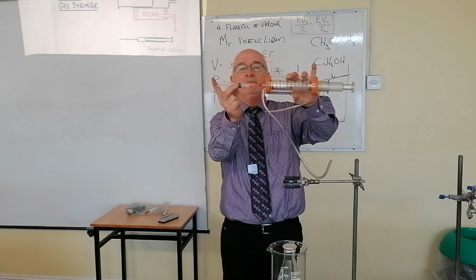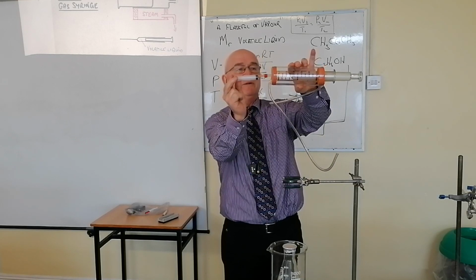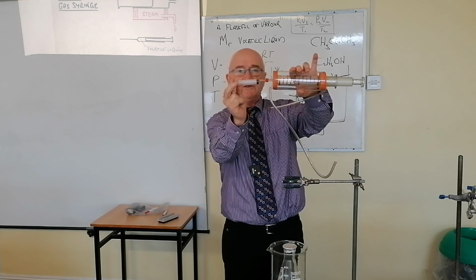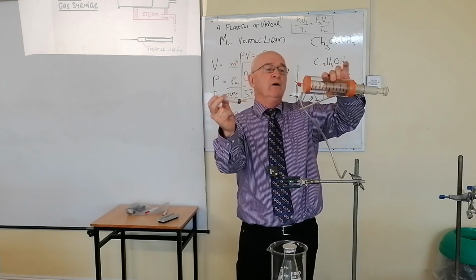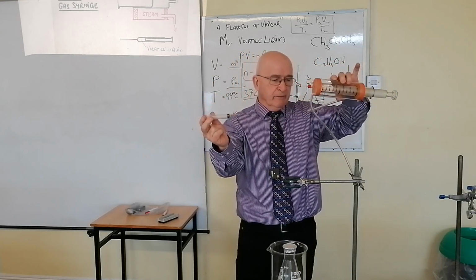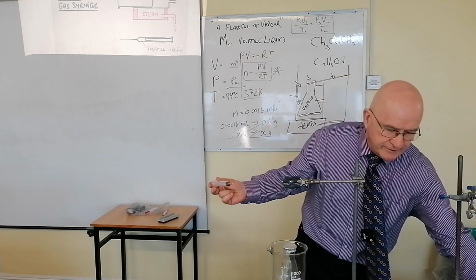You'd actually push it in through that there like that, and look, you'd push in the piston, and you'd see the other piston going out. Okay, and what would you do then? You basically would find it expanded from, we will say, it was at 40, and it might go up to 65. So you'd have 25 centimeters cubed of your volatile liquid in there.